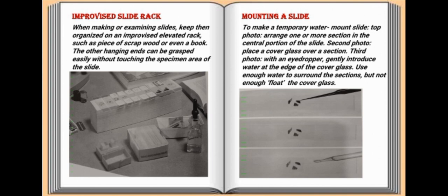As you can see, mounting a slide is the process of preparing a sample for viewing under a microscope by placing it on a microscope slide and securing it with a cover slip. Proper mounting ensures that the sample stays in place and provides clear focused images.